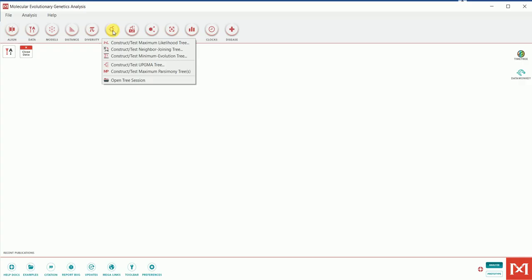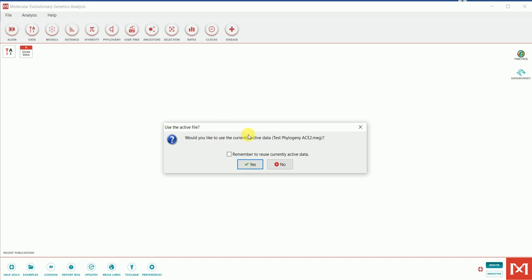Under 'Phylogeny,' it gives me different options for constructing the tree: Maximum Likelihood, Neighbor-Joining, Minimum Evolution, UPGMA, and others. For the purpose of demonstration I'm going to use the Neighbor-Joining method. You can decide which method suits best for your analysis — I've seen a lot of literature using Maximum Likelihood. For today we'll use Neighbor-Joining and hit OK.